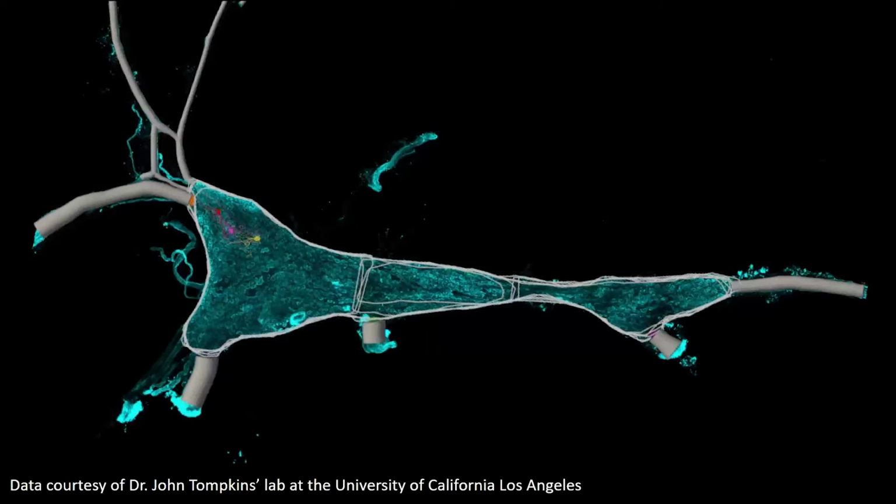With these FAIR terminologies embedded into the data file, it is easy for researchers to communicate the relevant anatomies to the scaffold engineers and ensure appropriate registration of the segmentations to the 3D structure models. These anatomies can also be surfaced on the Spark portal using the scaffold viewer to help communicate the specific terms to the portal users. So let's dive into how the Tompkins lab makes the data files like this one FAIR using Neurolucida 360's connection to the SciCrunch terminology database.